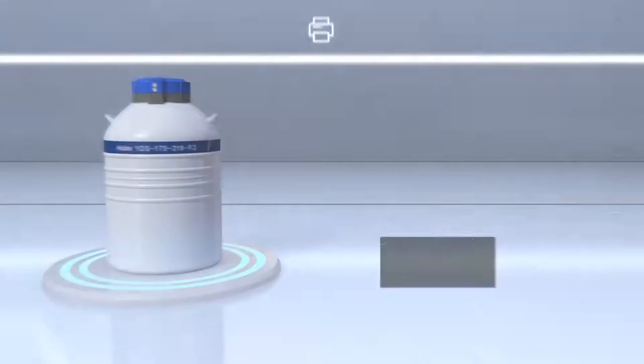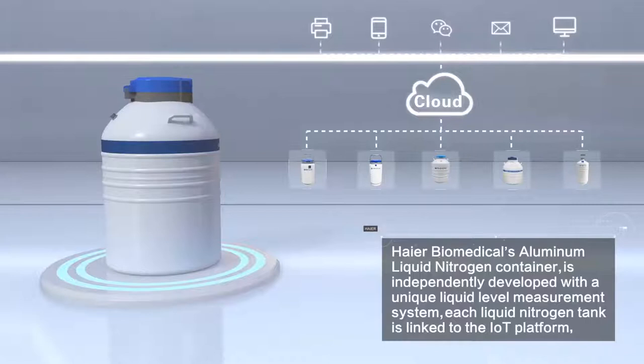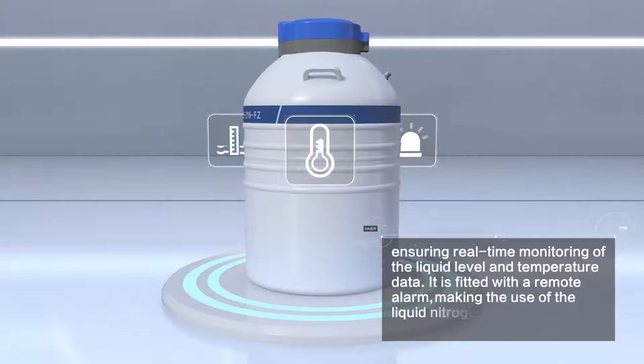HIAR Biomedical's Aluminum Alloy Liquid Nitrogen Container is independently developed with a unique liquid level measurement system. Each liquid nitrogen tank is linked to the IoT platform, ensuring real-time monitoring of the liquid level and temperature data.